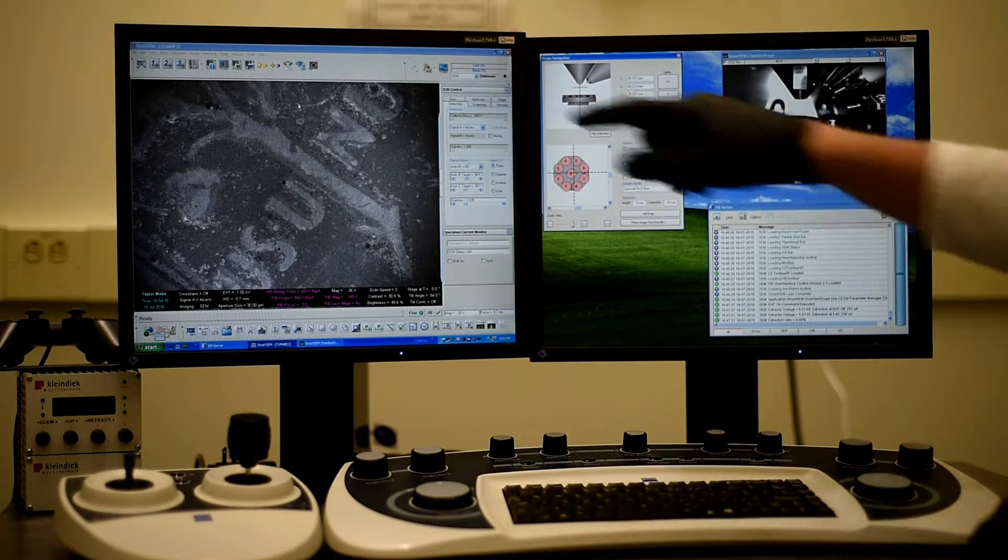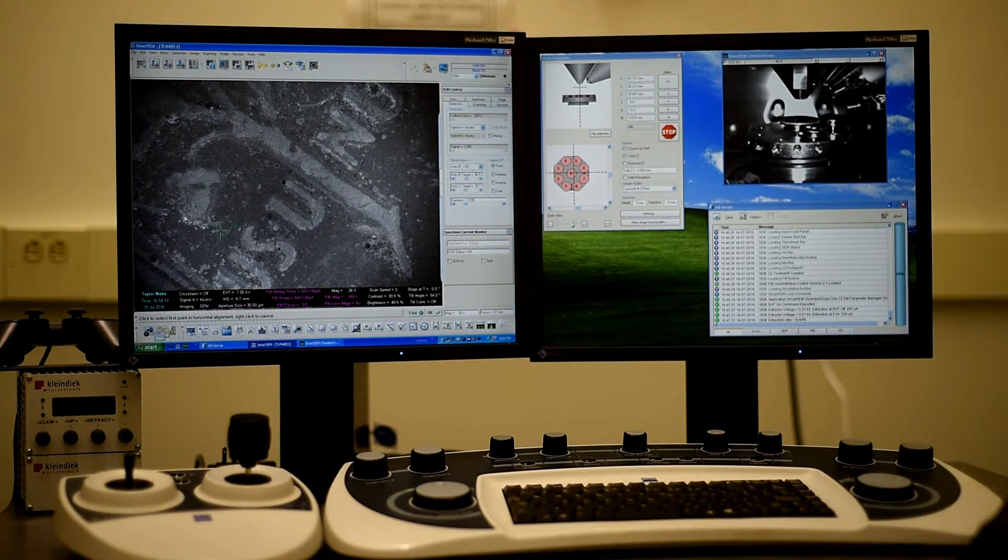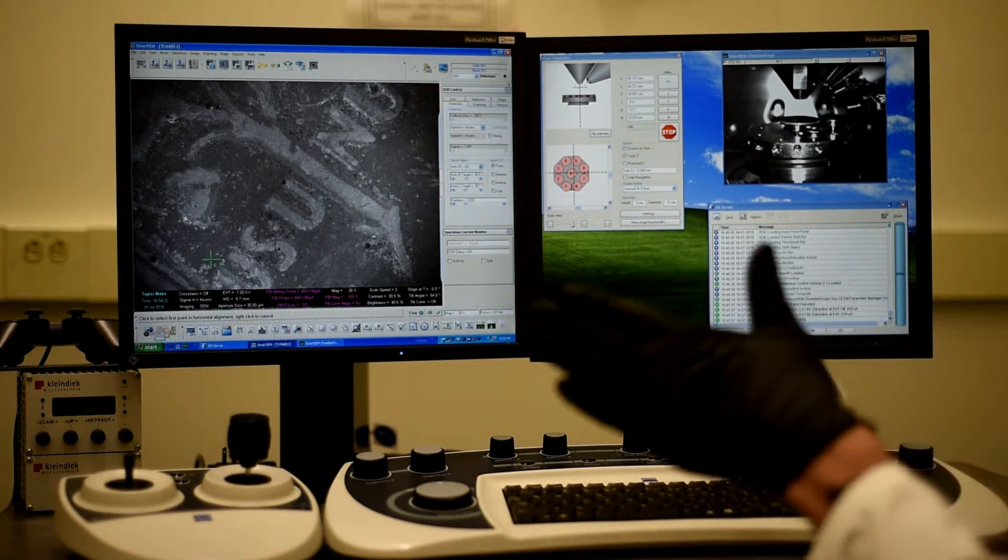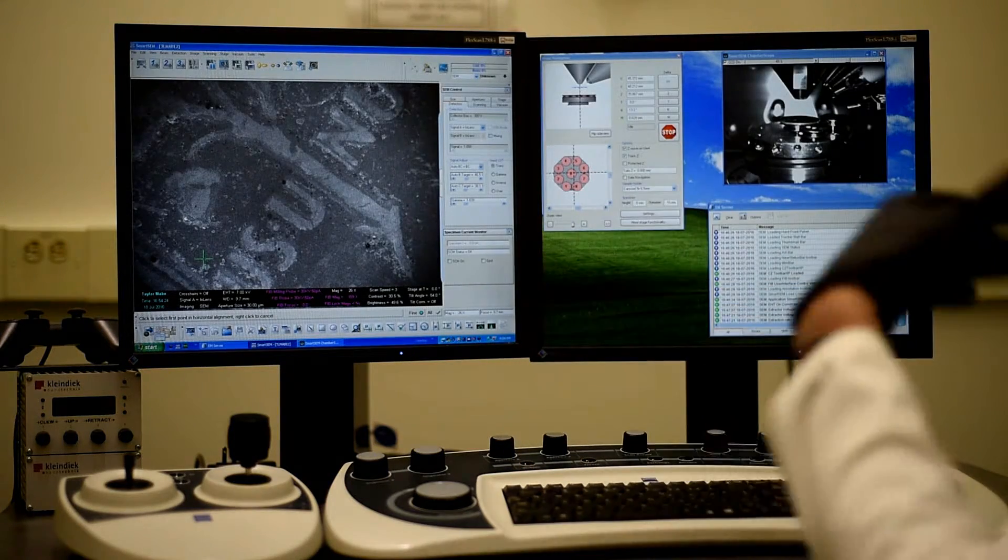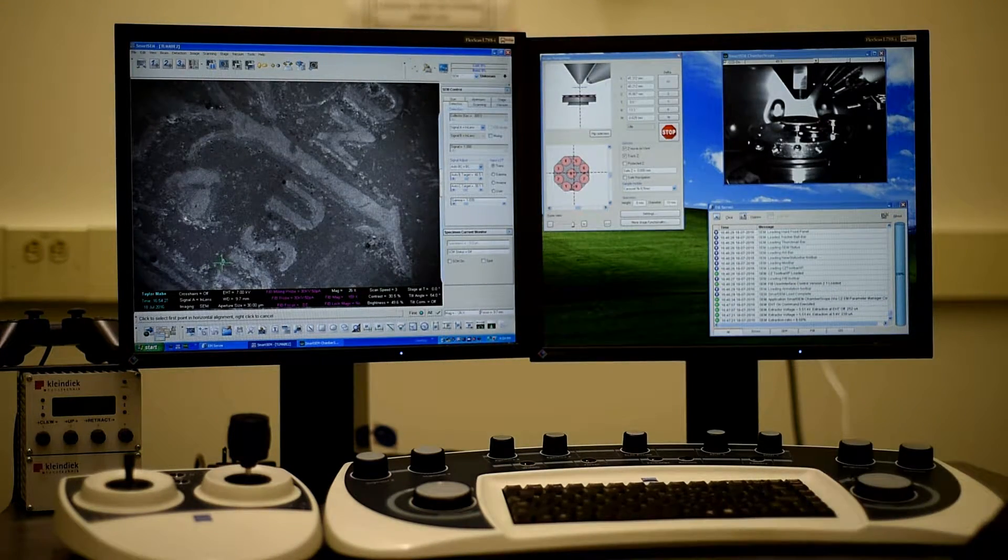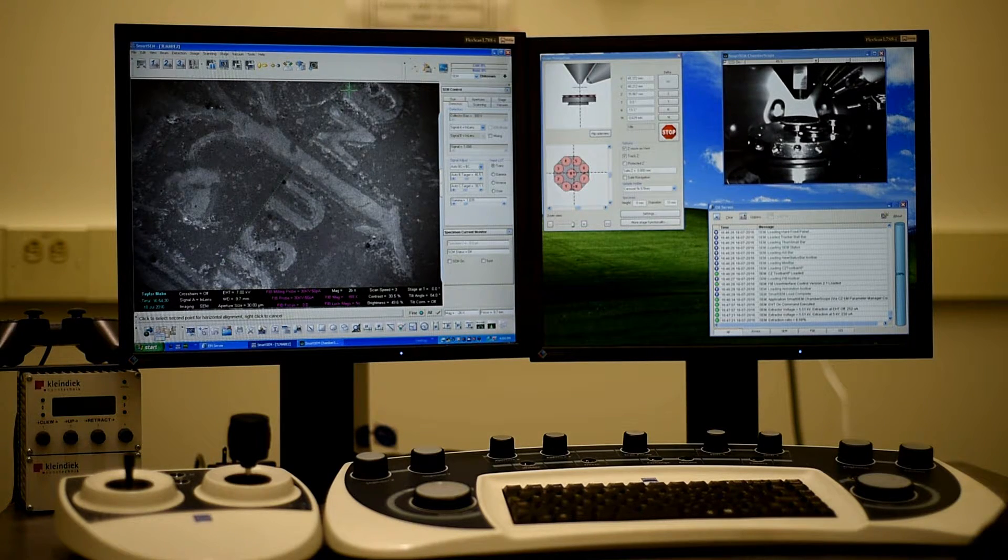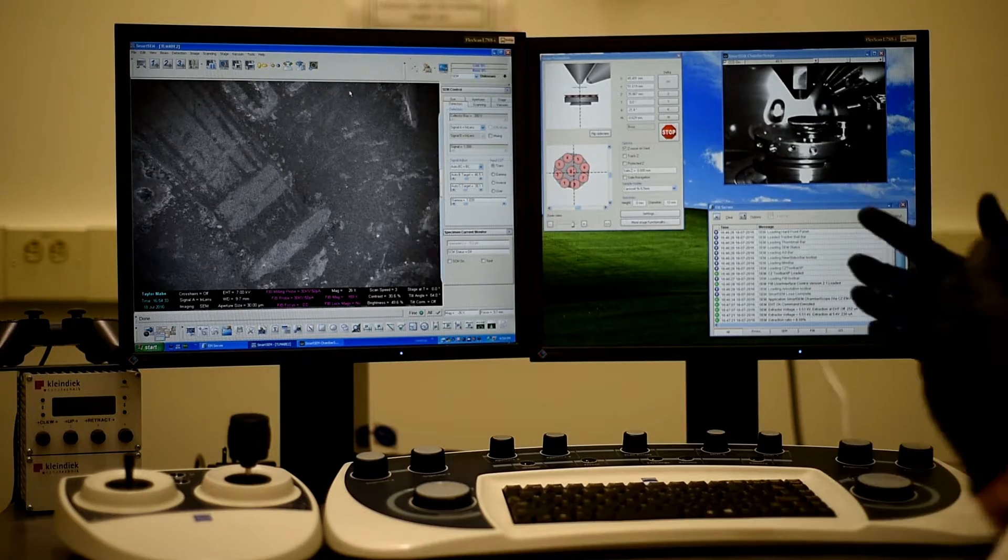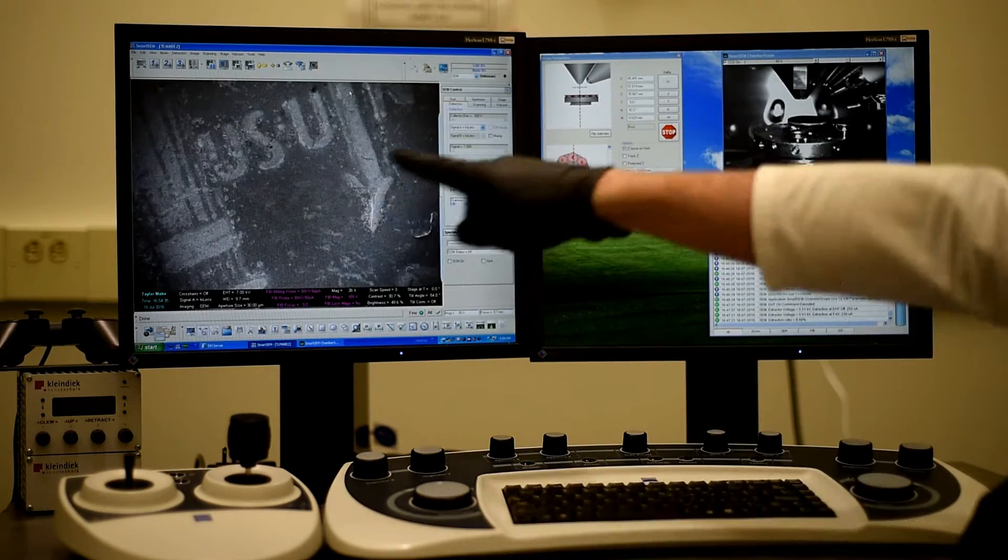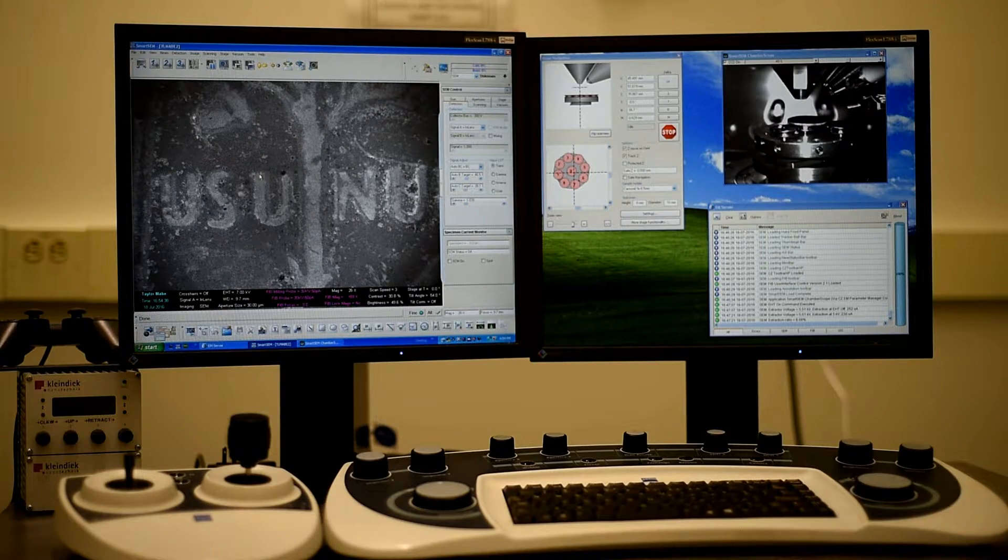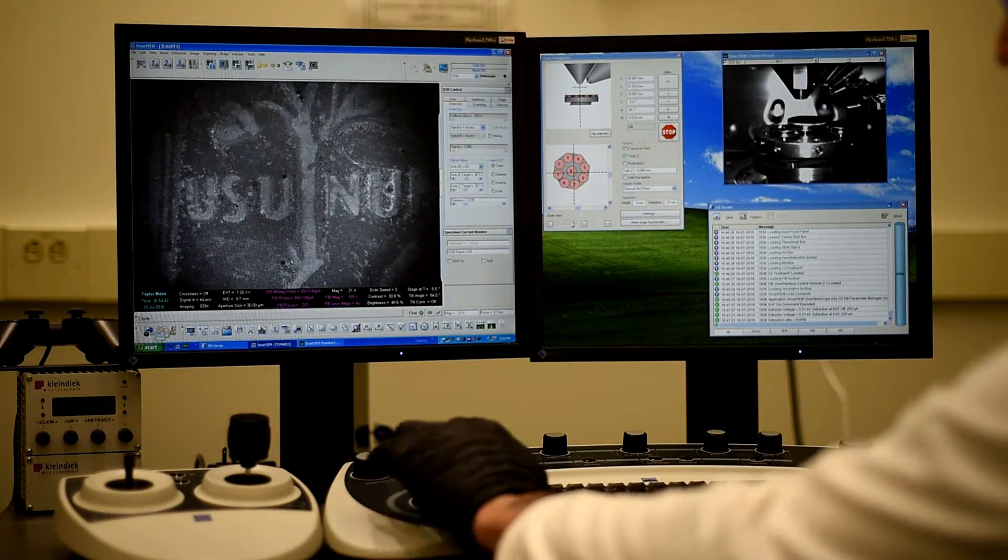Well, if you're positive you're not going to crash into anything, and you've got a pretty high working distance, you can click this box up here, the blue box. And then you can draw a straight line. So what we're going to do is we're going to rotate it so that it's aligned perpendicular. So I will draw a line straight to this text and double-click it. And now what's happening is the dime's rotating so that we can read the text in a straight manner. So now you can see that you can actually recognize part of this dime.